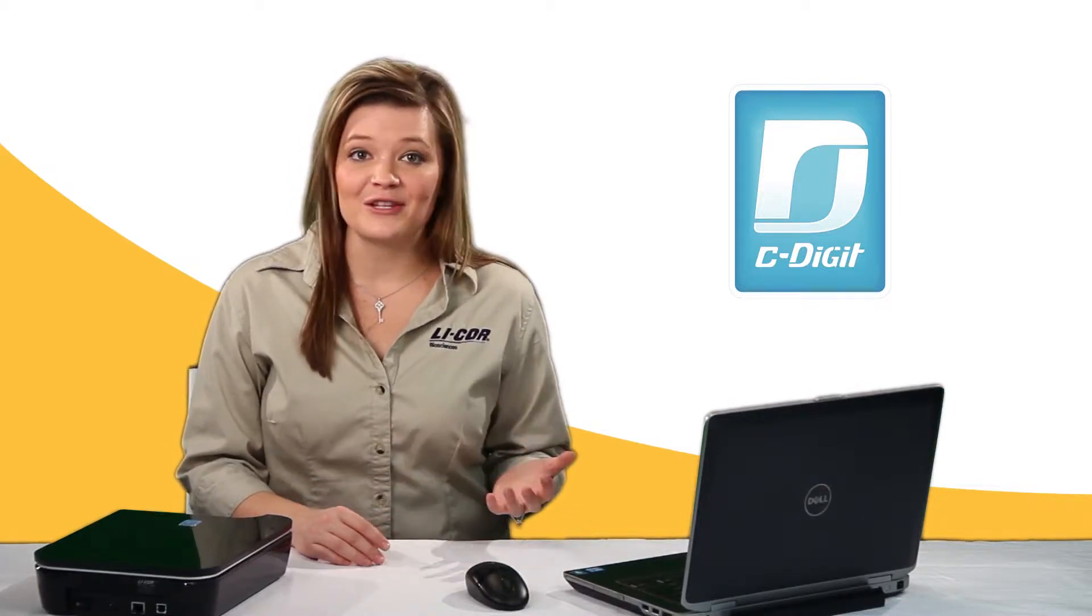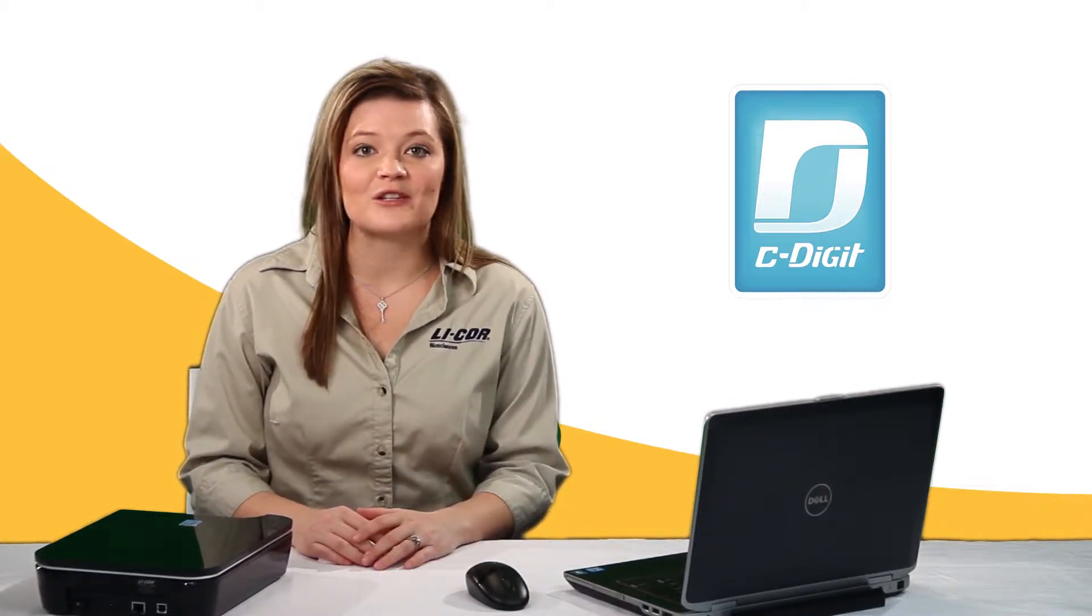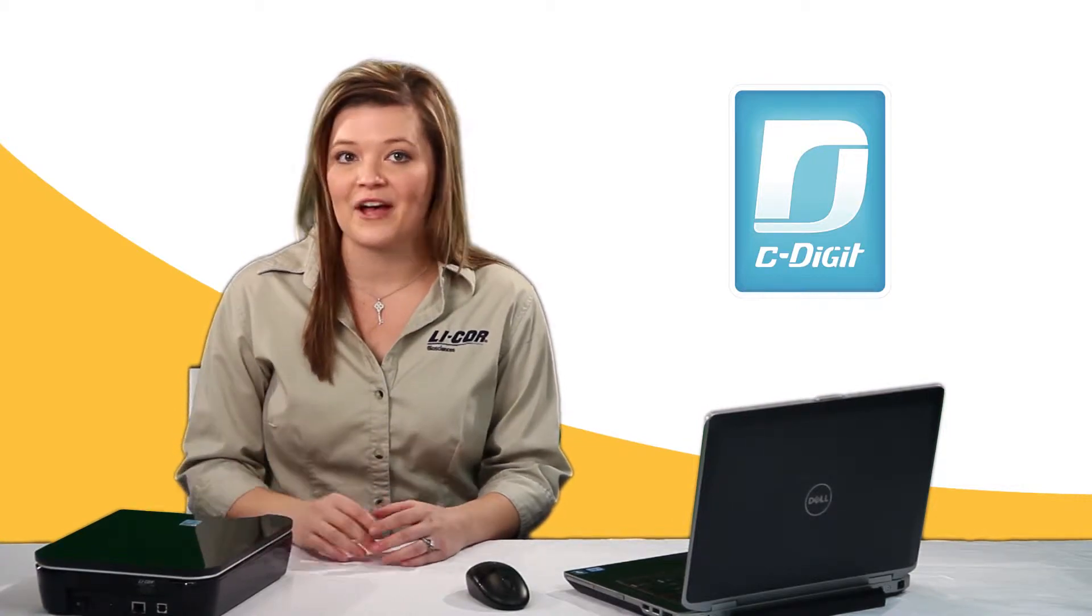Hi, Ashley here. In this tutorial, you will learn the multiple ways you can place a blot on the C-digit blot scanner.